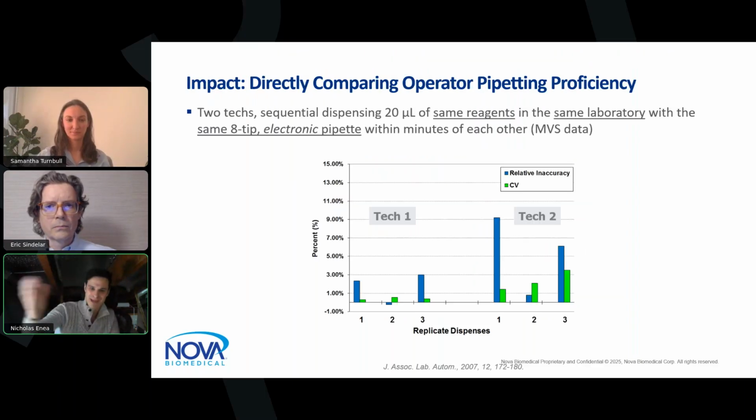But zooming back in, even from a manual pipetting perspective, because most manual processes, especially with scale, will be transferred over to some type of automated process, really making sure the techs are optimized as well. I joke, there's liquid class optimization and there's people optimization also, right? If you don't have people optimization and they're not calibrated in a certain sense, then you're not even going to be able to optimize liquid classes once you get to a liquid handler, because you're going to be chasing a target that's always moving. So these are really things to think about when we talk about optimization.